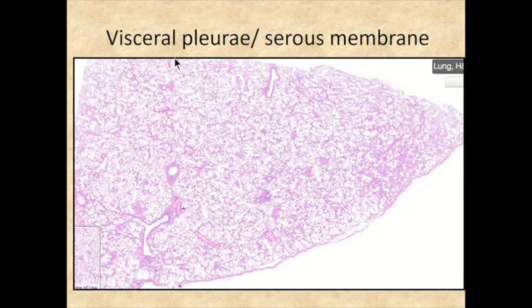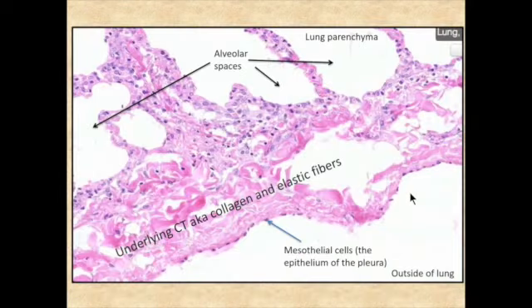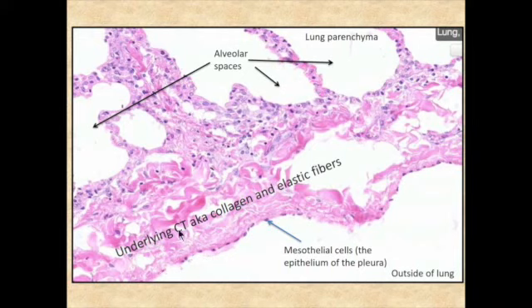In this section, you can see the cut part of the lung continuous with the rest of the lung parenchyma. There's a slightly darker pink line — this is the site of the visceral pleura. Zooming in closely, you can see the simple squamous mesothelium — called mesothelium because of its derivation — on the outside of the pleura. Underneath is the underlying connective tissue, and it's continuous with the lung parenchyma; alveolar spaces are visible in this area.